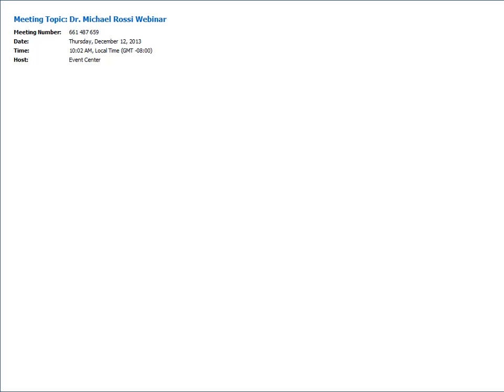What we know is the standard deviation of the positional accuracy of the labels that we're using to call these is 150 base pairs. And so with that, we're able to quite confidently get down into single-digit KB calls on deletions and insertions. We can probably go a little bit lower if you have a targeted CNV that you're looking for and are simply trying to confirm it, or dive in and get a little more granularity. But on a genome-wide scale, we get a range from single-digit KB all the way up to multiple megabase size CNVs.